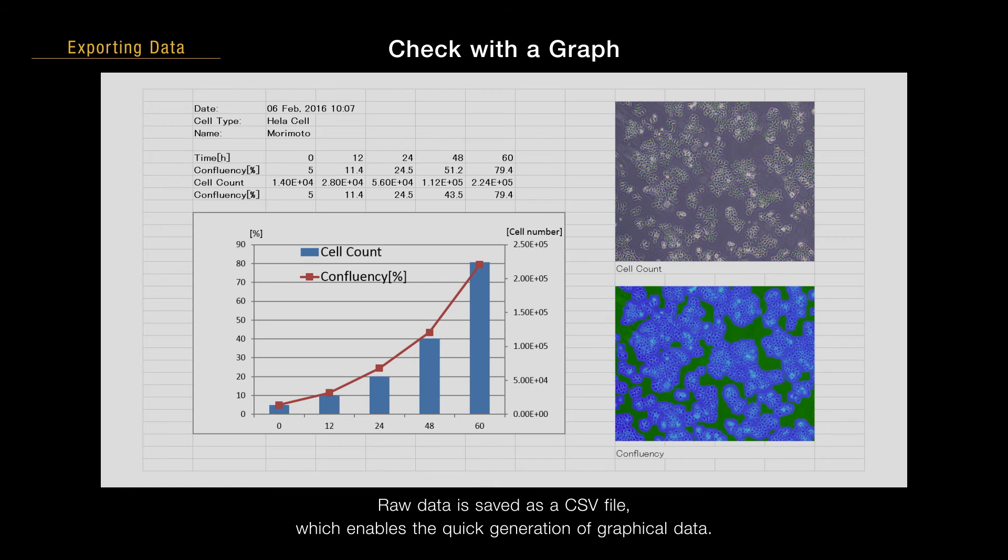Raw data is saved as a CSV file, which enables the quick generation of graphical data.